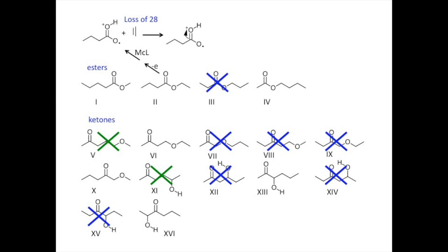We have seen this structure lose an ethylene molecule. An induction step might move the positive charge to the carbon atom. Now, a radical-initiated cleavage would remove a neutral hydroxyl radical. The result would also be an ion at 71 atomic mass units.